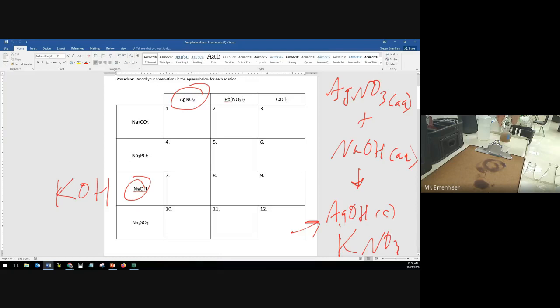I really want to filter this one, but I don't have a filter, but maybe we will. Look at the solid in there. Let's filter this one. For sure. Sorry, dude, you are going to be filtered. It's not optional. I'm going to throw this one away because I didn't do anything.